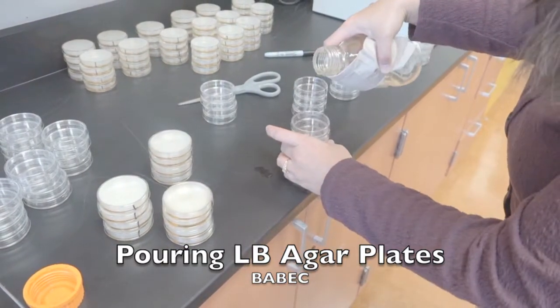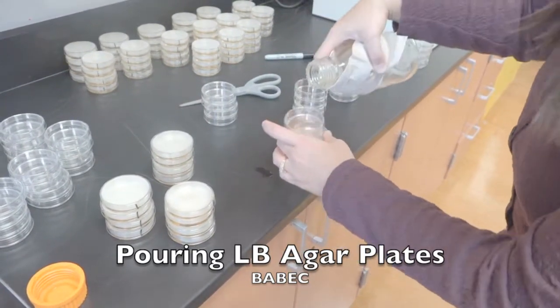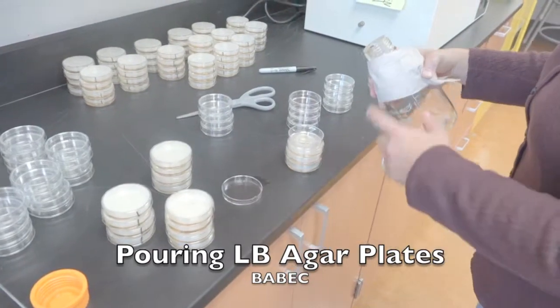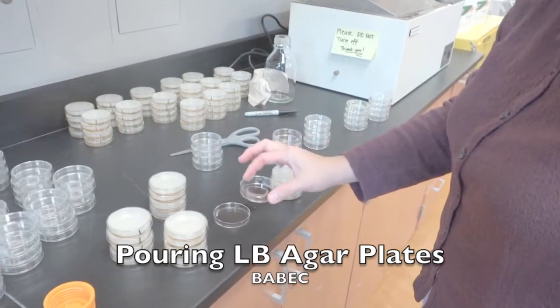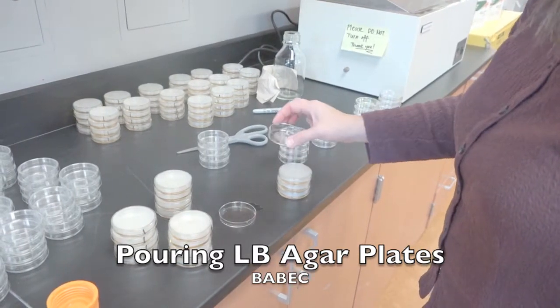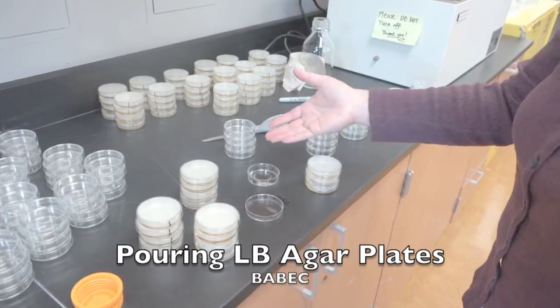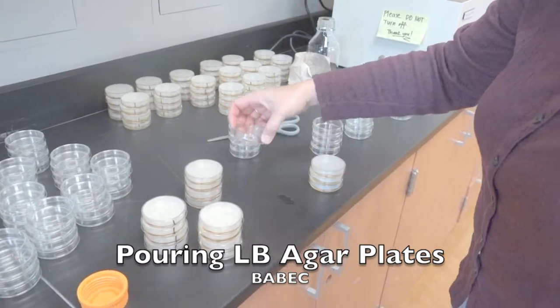I'm getting really close to the end of my bottle here. Notice there was hardly any left for this last dish, so you have to be careful and try not to waste a dish. In Baybec we are resourceful — we try not to waste things. This is not actually a good use of your dish because once it's going to gel, it creates a separation if you pour another set of LB agar in it. So it's pretty much a wasted dish — try not to do that.